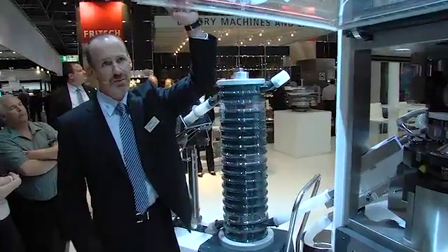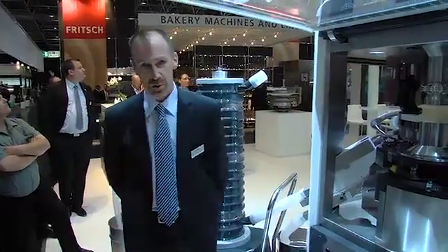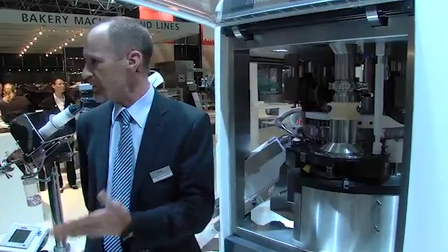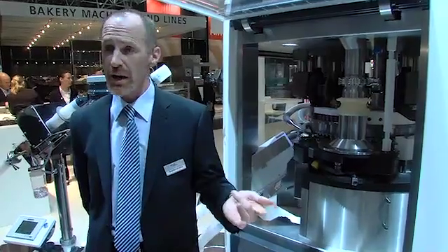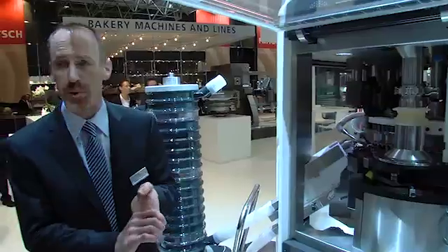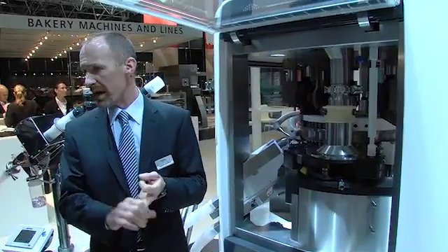As I go through some of the key features that Emerson just described, I would ask that our listeners and viewers keep in mind two key design criteria that FEDA Germany had incorporated into the development of the press. Those are efficiency and the Tri-Easy concept, focusing on three primary components of machine usage: changeover, operation, and maintenance.